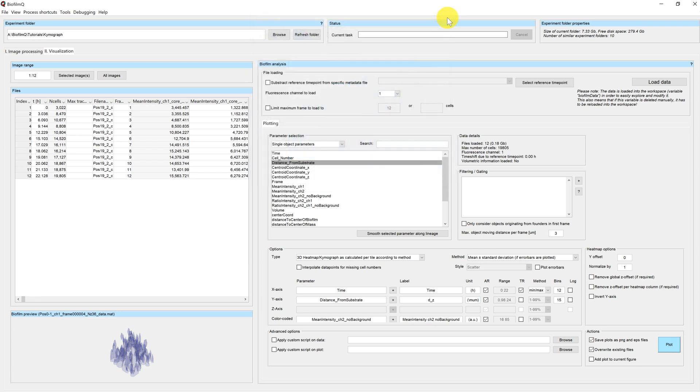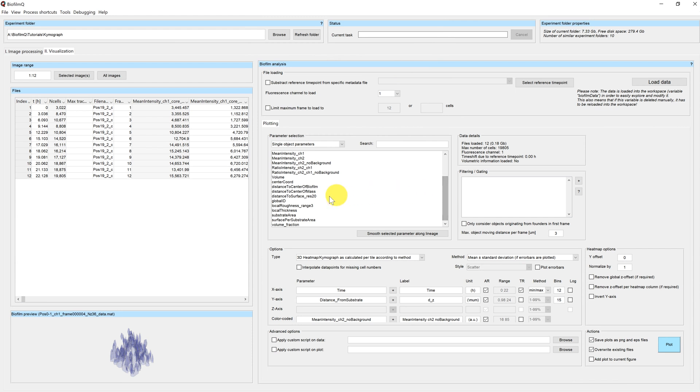For example, we can look at the distance to the surface of the biofilm. So now we will not average over the biofilm height, but over the distance to surface.